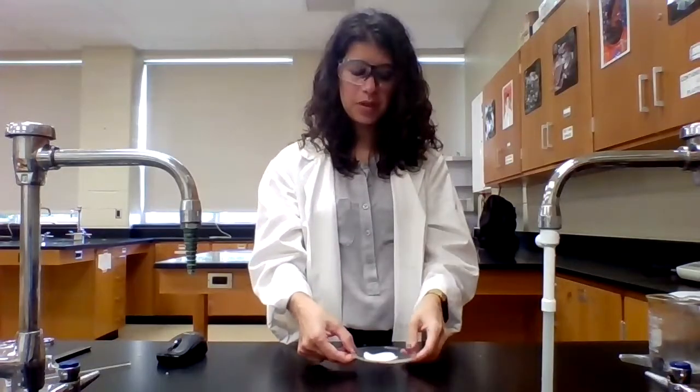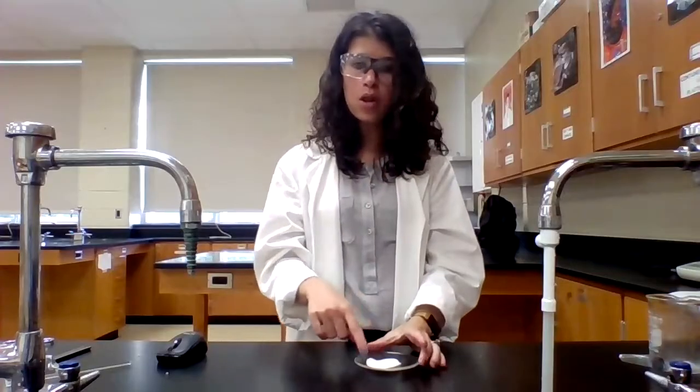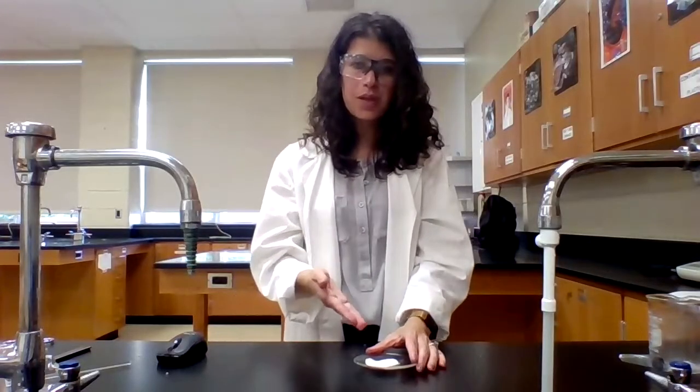What I'm going to do is I'm going to take the filter paper with our product on the watch glass. I'm going to put it in a drying oven, and then I'm going to take it out, let it cool, and weigh it. And then I'm going to put it back in the drying oven, take it out, let it cool, and weigh it. And so just like with before, the only way for me to know that all of the water has evaporated is for me to heat it until I get a consistent mass. And so I can't visually assess if all of the water is gone.